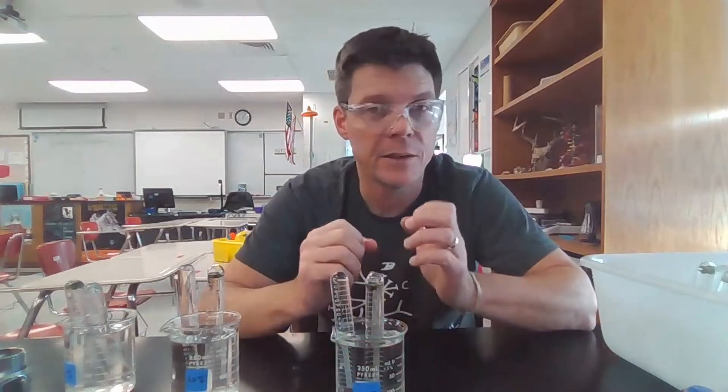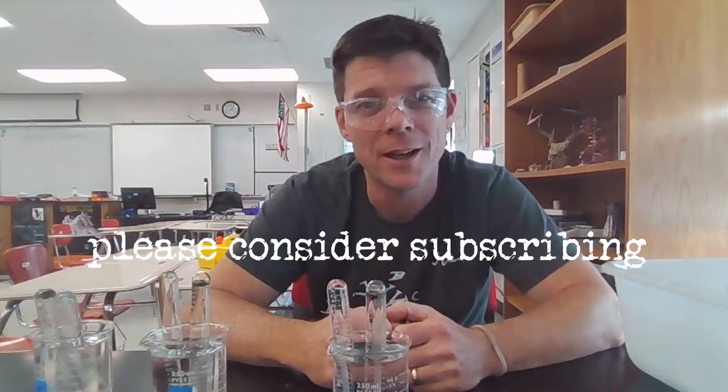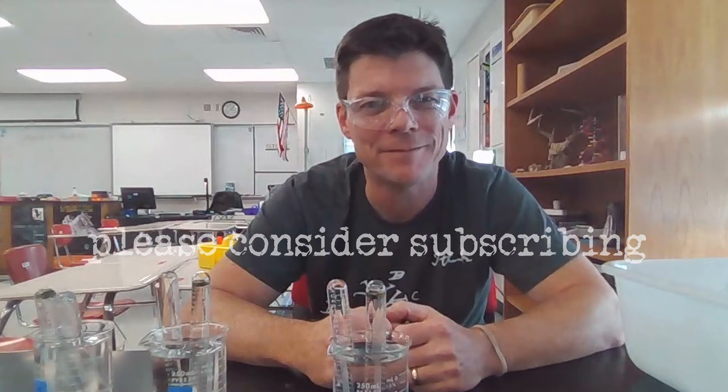The amount of oxygen being generated is not the same in the different sodium bicarbonate solutions. We'll come back after 24 hours and take a final look at the test tubes to see how much oxygen the leaf disks were able to generate.